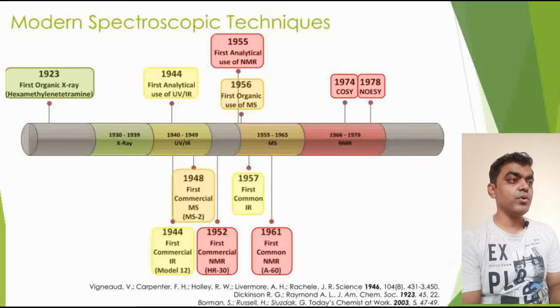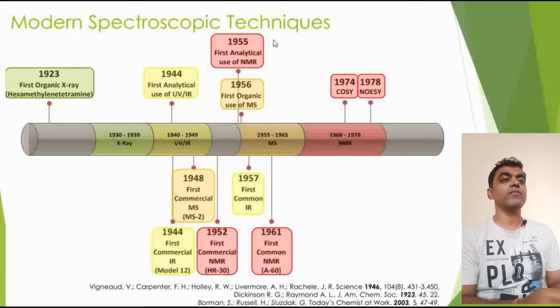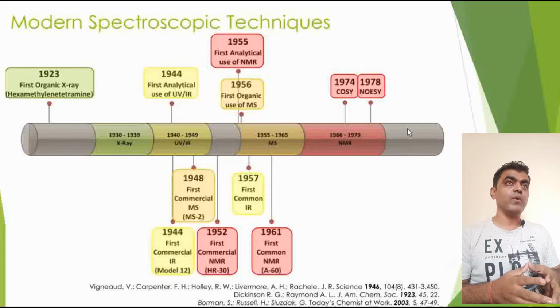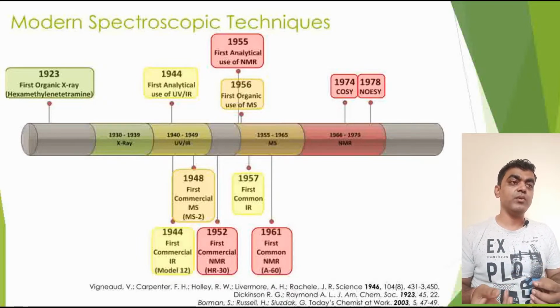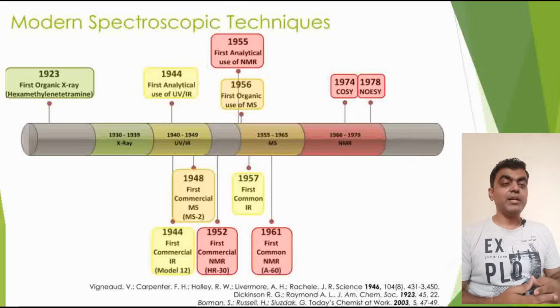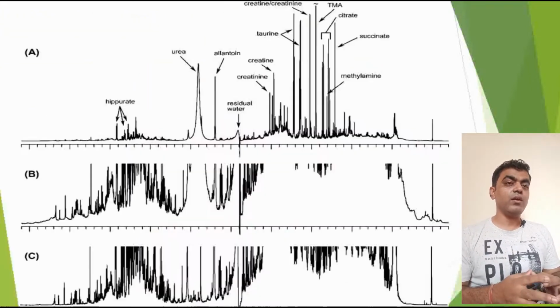But why I showed you this is, as we moved ahead down the line, people understood the importance of NMR, and the NMR technologies also evolved. So NMR is not only a simple system where you get one spectrum and try to interpret that data and get everything, but at the same time from NMR data you get a lot of information.